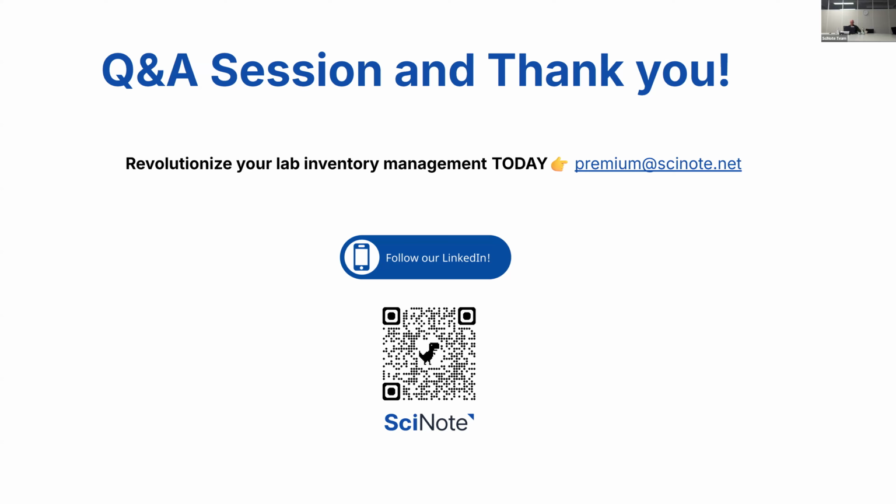Is it possible to integrate item location as a column in inventories? It's difficult to change an item location fast at the moment, or change multiple item locations. So I'm sure this is coming from an existing user, I would suppose. As far as I know, no, it's not possible currently. But let me double check this, Andreas. I'll talk with customer success and the product team, and somebody will reply to you with an answer to make sure whether this is possible or not.